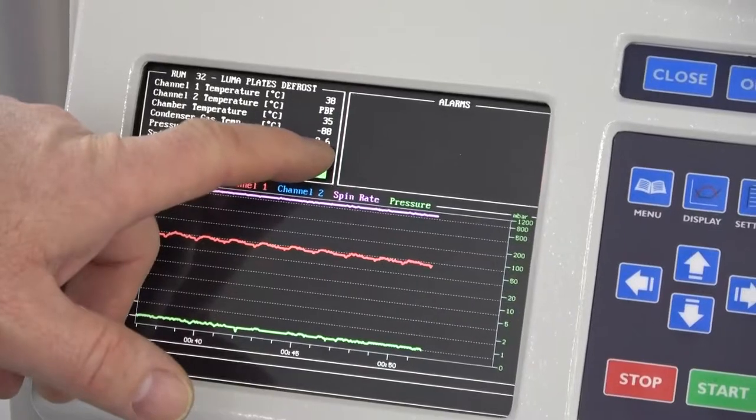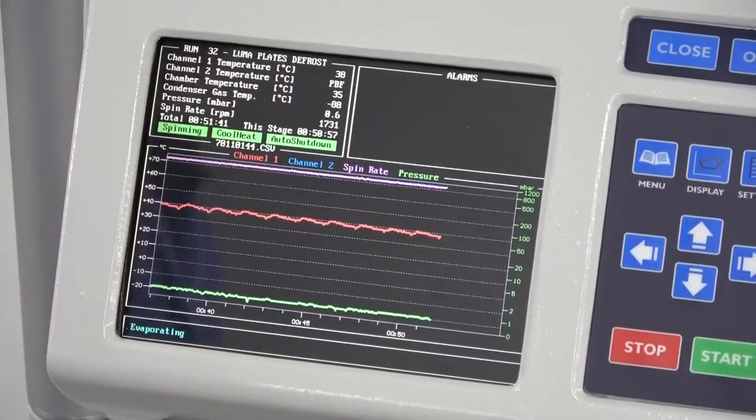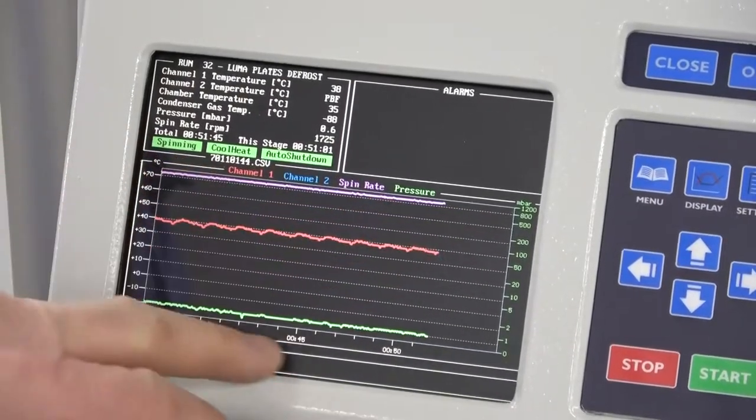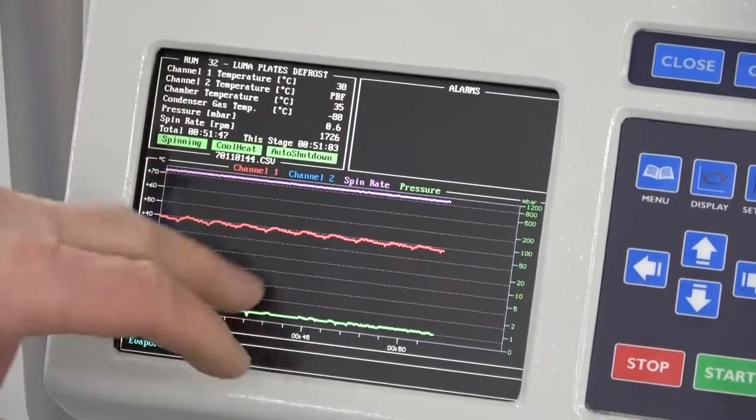And then also in the vacuum, we're down to 0.6 millibar. Just excellent working. The graphs are nice and steady. I've been running this probably for the last 20 minutes.